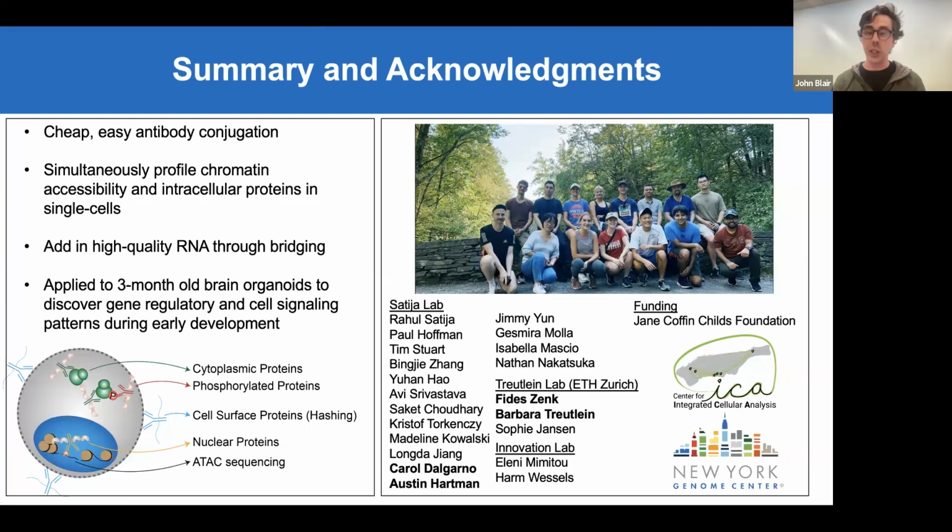In these early experiments, we're using it somewhat as a screen where we can find ones that do work well, put those aside, say these ones are good, and then the other ones we most likely won't use again. That could be interesting in the future when people use the Phospho-seq kits for people to share what antibodies they used. And absolutely.